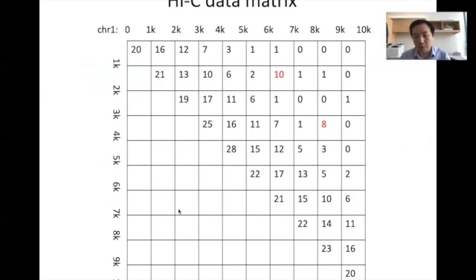So when you process Hi-C data, you put the data into different bins. Of course, the deeper sequencing depth you have, the smaller window you can use, right? Suppose this is your 1 KB window, this is chromosome 1, 0 to 1K, 1K to 2K, and so on. And then your y-axis is the same thing, right? You are investigating the chromatin interactions within chromosome 1, right?